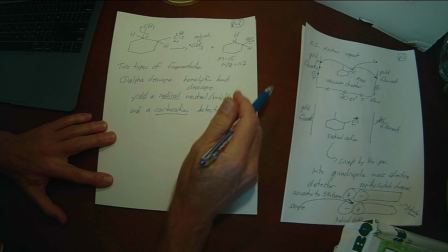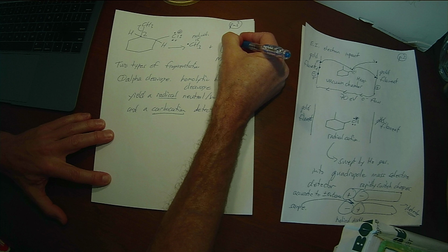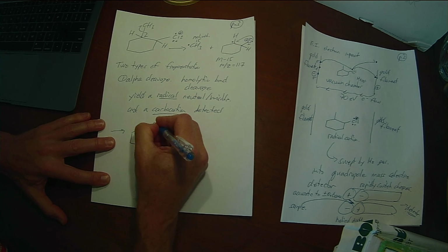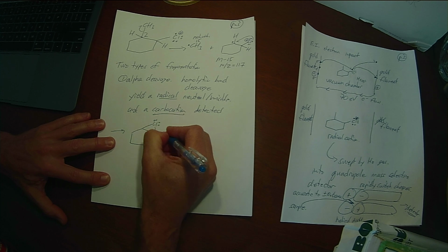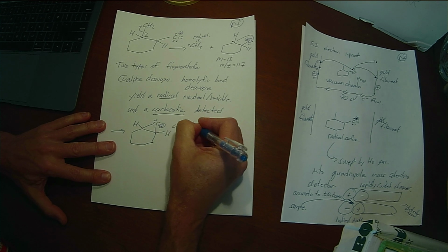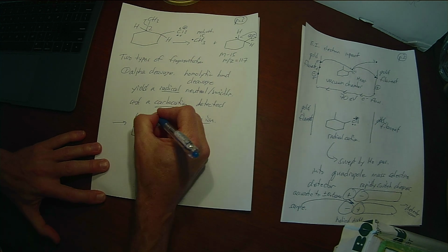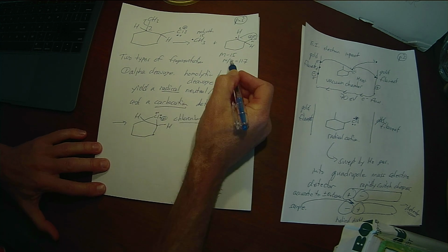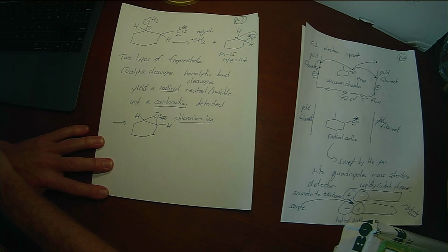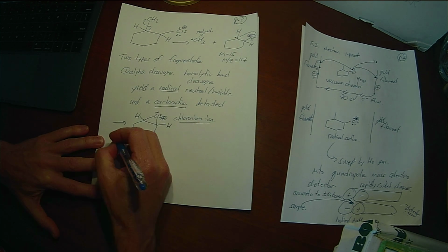We might expect this loss of methyl to be pretty favorable for the 2-chloro derivative, because now these two electrons can join with each other, and you could end up with a cyclic chloronium ion, which is similar to what you've seen when you're adding halogens across a carbon-carbon pi bond. So that chloronium ion should be fairly favorable, and this M-15 peak might be more prominent for the 2-chloro derivative than it would be for some of the other ones, where these radicals would now be further away and not able to combine. So that's alpha cleavage, right?